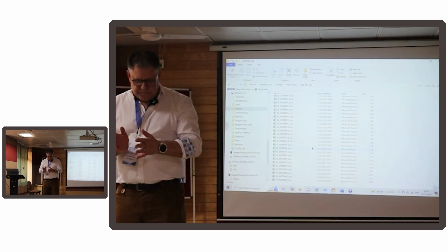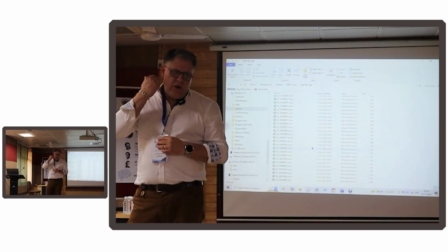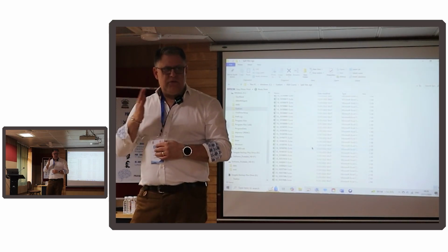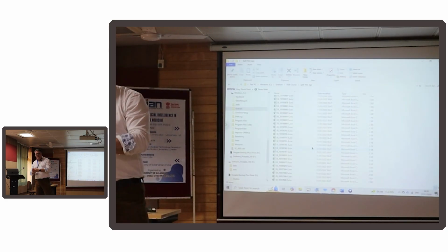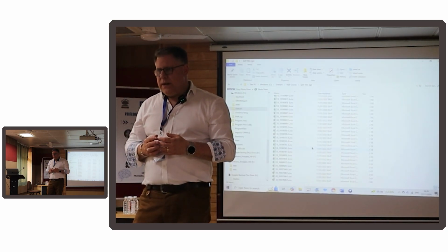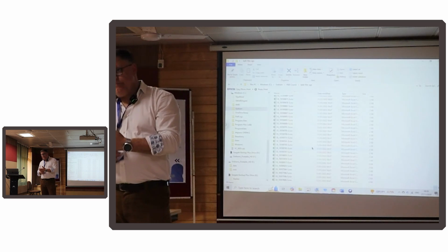By splitting it up, you can use Weka as a way of looking through transcriptomic or proteomic data for enrichment. You want, frequently the first time, to enrich for a set of genes that stably answer your question. If something predicts something, then that's interesting.